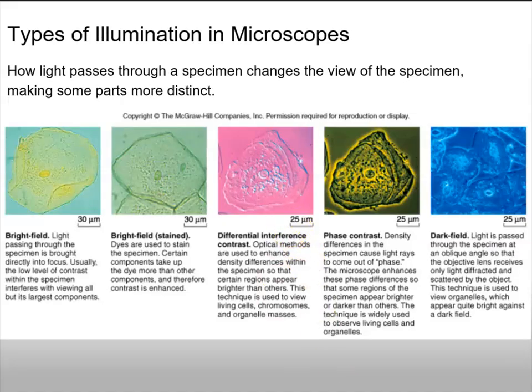The different types of microscopes can have different types of light sources, and so you can get some different images. We can also use different types of stains to get different images. We can see different things on the cells, and so these are all human cheek cells right here, and with different types of light and stains, we can actually see different structures within those cells. So we can see the outside here, that's the cell membrane, this little dark circle in the middle, that's the nucleus, and you can see there's the nucleus in this one. This one's a little bit folded over, but you can still see the cell membrane on that. So we can see the different cell parts a little bit differently and easier under different stains and different light sources.